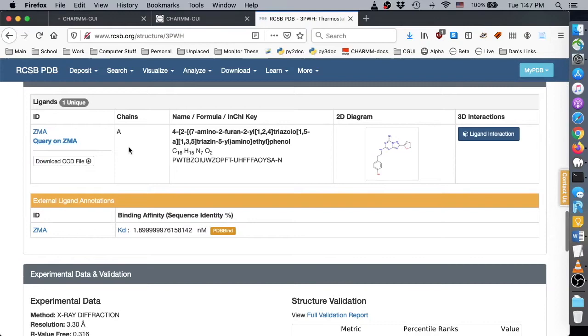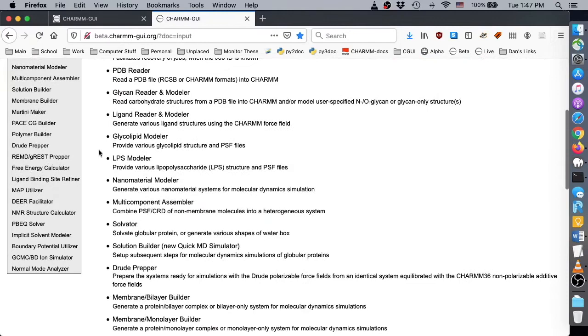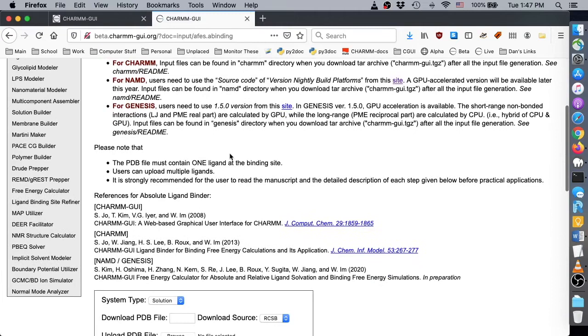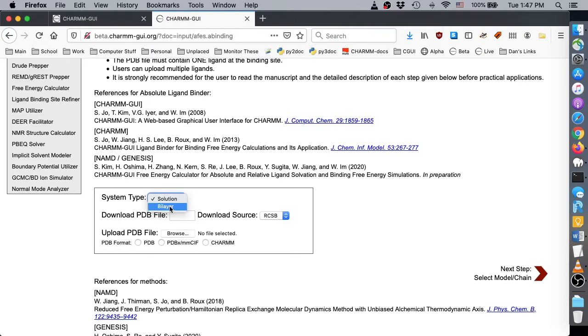To get started, go to Input Generator and find Absolute Ligand Binder in the Free Energy Calculator submenu. Change the system type from Solution to Bilayer. You can upload your own structure or enter an RCSB ID. In this demo, we enter RCSB ID 3PWH and then click Next.